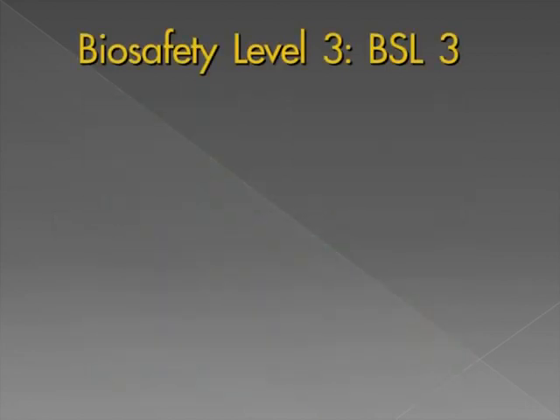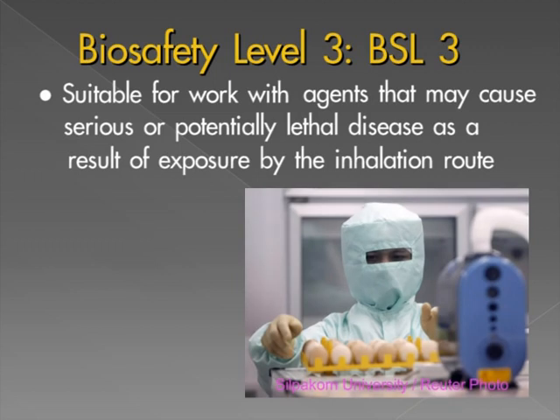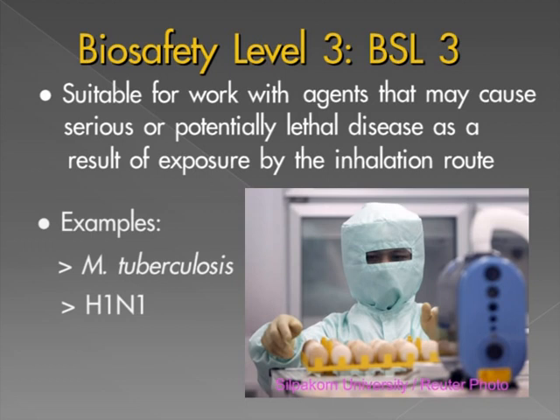Biosafety Level 3 practices, safety equipment, and facility design and construction are applicable to clinical, diagnostic, teaching, research, or production facilities in which work is performed using indigenous or exotic agents with the capacity for respiratory transmission that may cause serious and potentially lethal infections. Examples of agents that should be manipulated in a BSL-3 facility are Mycobacterium tuberculosis and H1N1 influenza virus.